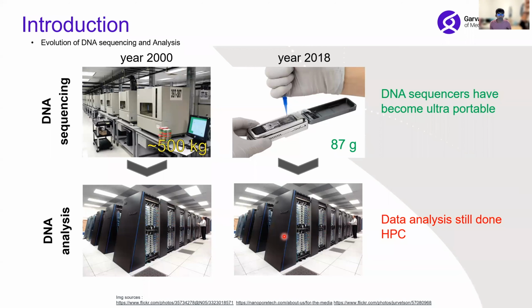What I mean by supercomputers is rack servers, a lot of rack servers, like the Icon server in the department that you might be using. Basically, a supercomputer is composed of hundreds of such blade servers. That's how they usually process the data coming from even this little sequencer, because the data size is hundreds of gigabytes, and the analysis algorithms that do that putting together are very time consuming.